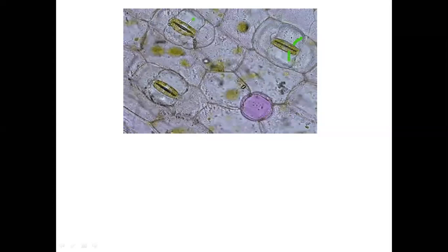Yeah, this is a guard cell, this is a guard cell, then at the center there is a stoma. Sorry, it is a stoma. When it is one, it is a stoma.